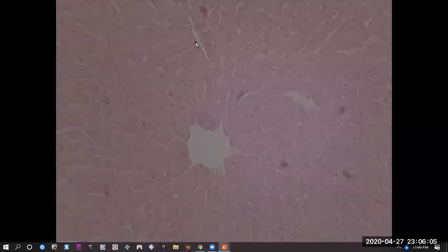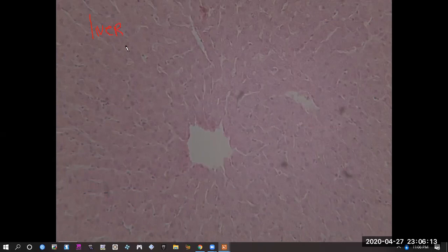So next we have the sample of the liver, an accessory organ of the digestive system. And here in the liver, we're seeing the space here in the middle, appropriately named the central vein, in the center of each lobule. Hepatocytes, hepato meaning liver, hepatocytes are liver cells, and the rows or columns of liver cells here stained in pink, that's the term hepatic plate, are the rows of liver cells, hepatic plates.